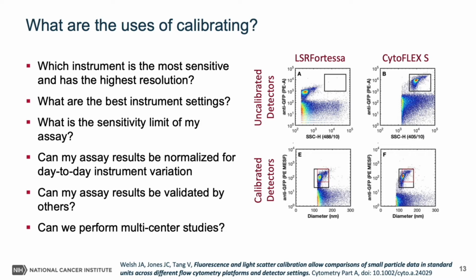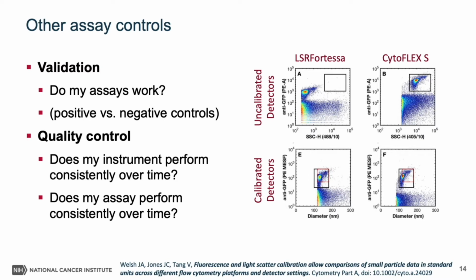It'll also allow you to define the limit of sensitivity for your assay and normalize for day-to-day variation. Importantly, it will allow others to validate your assay and lay the groundwork for standardized multi-center studies to become a reality.